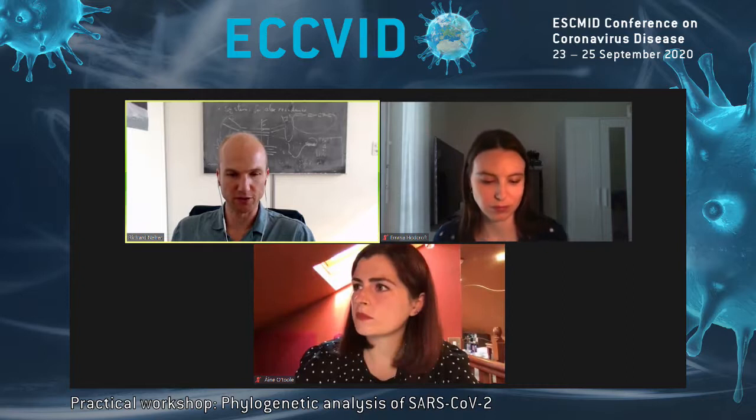So there is one question about cycle threshold, so CT value thresholds for sequencing. Yeah, that depends a lot on how good your PCR is. If you have very high CT values, you'd probably get gradual dropout of amplicons, because some of them work better than others.